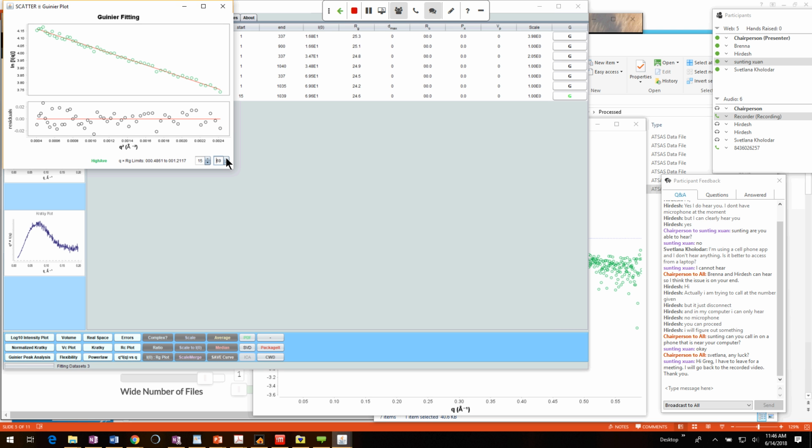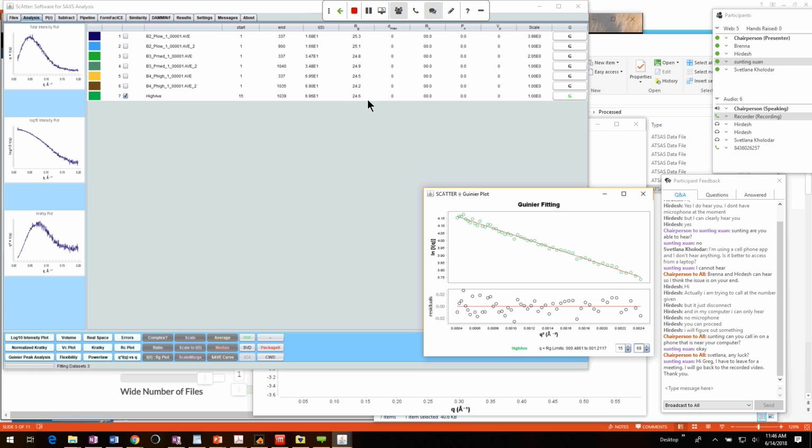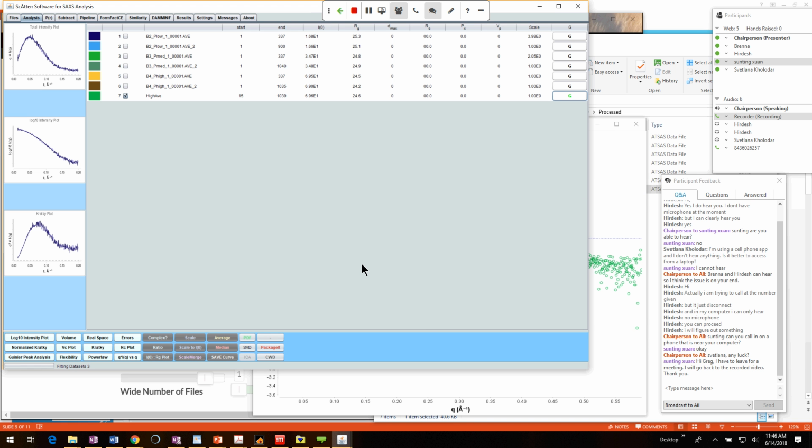A good globular particle would be something like this. So the Rg here is printed at 24.6, roughly, for this stage. So I'm done with that. I'm now going to estimate the volume of the protein.